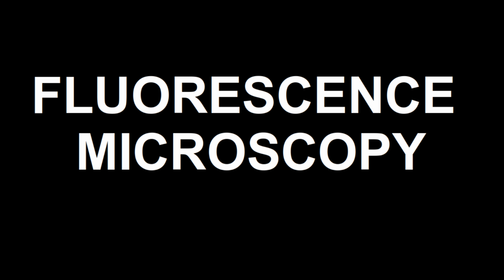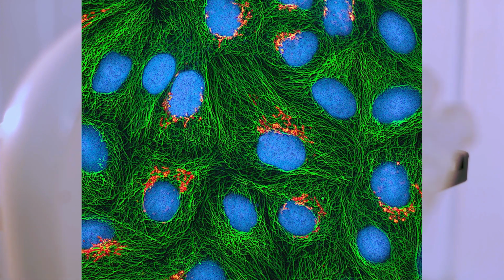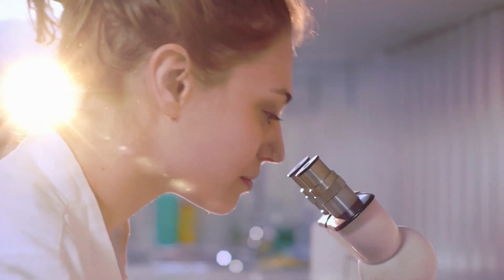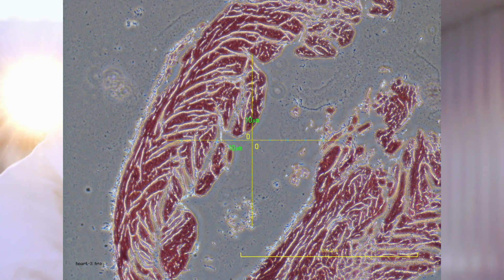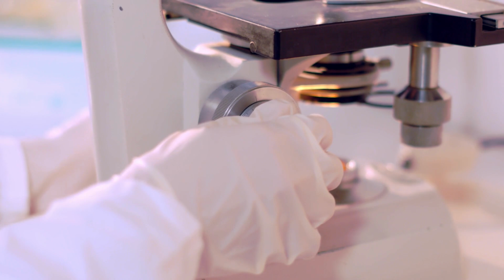Hello and welcome to this video on a technological method used in microscopy called fluorescence microscopy. As the name might obviously tell you, the whole premise is to make something inside your cell, tissue sample or anything else glow under a certain light. Now we should be clear that this is typically used in biological sciences, but it can find roles in others where making fine details obvious is useful.